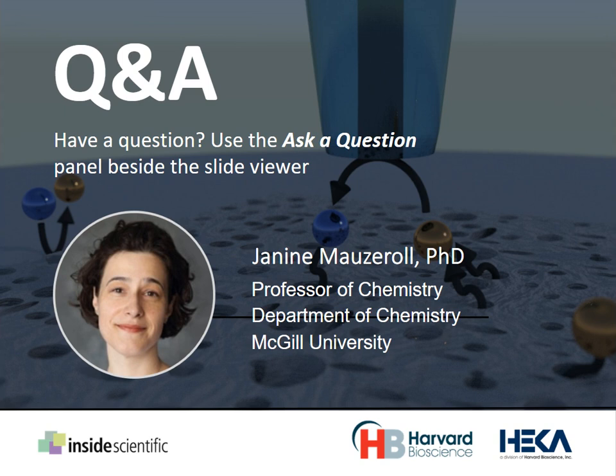Now, in terms of the oxidation state, usually ion selective electrodes are based on a principle where they'll use crown ethers or molecules that will capture the ion. I apologize, if the ion changes charge, it may need another molecule to capture it. And so unless you can directly electrochemically react the ion at the microelectrode surface, you could plate it as well.